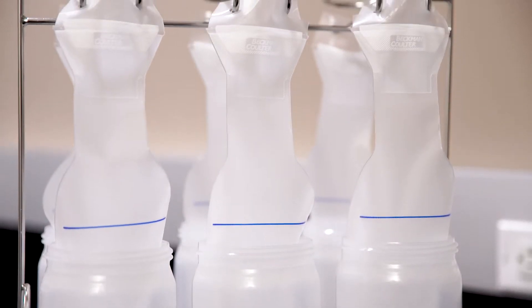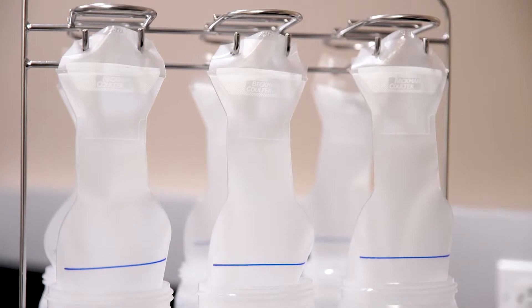In this video, we'll cover new ways of recovering an isolated pellet after centrifugation.